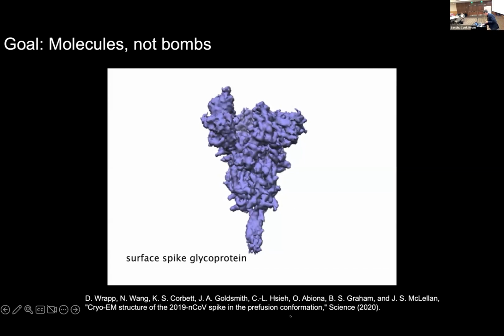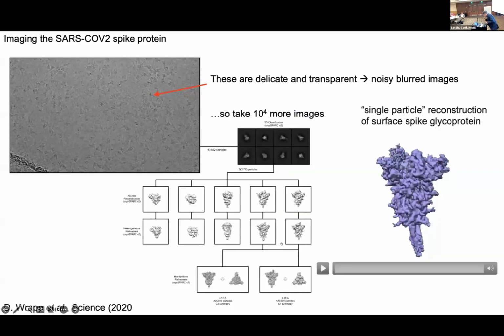of bombs? So I found this was the paper that came out in January of 2020. So this study, it isolated these proteins within several days of finding SARS-CoV-2. And then it found an image and it reconstructed that image after 13 days, I think. And then it was one of the quickest publications in the history of Science magazine. Okay, so how do they take these images?